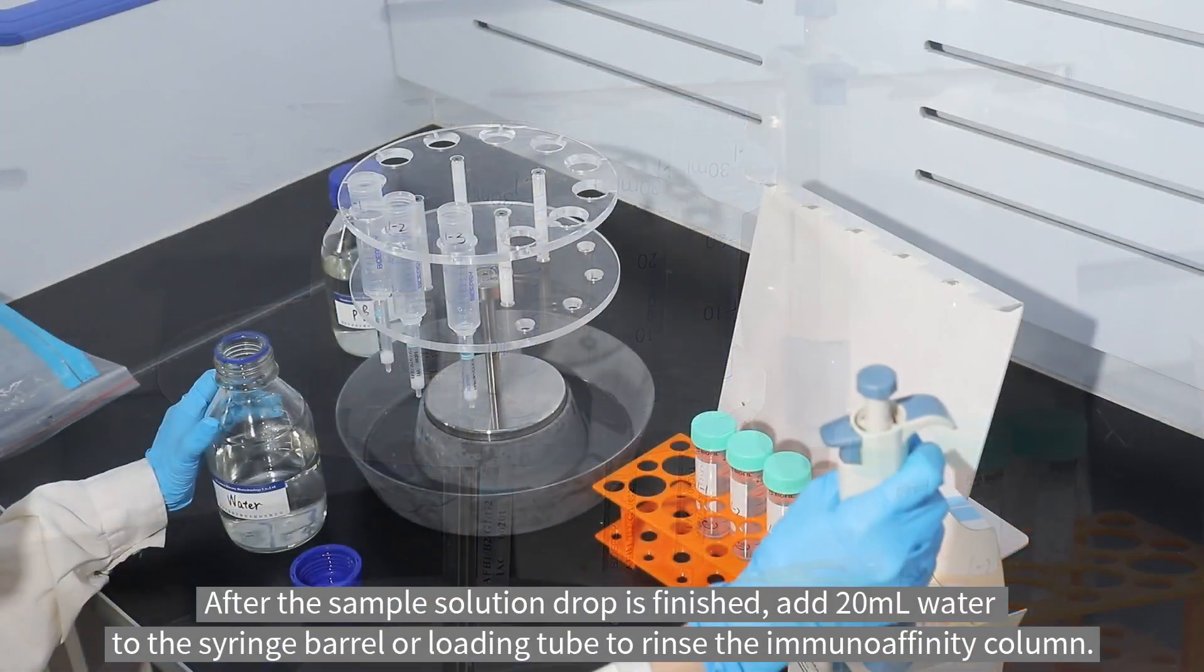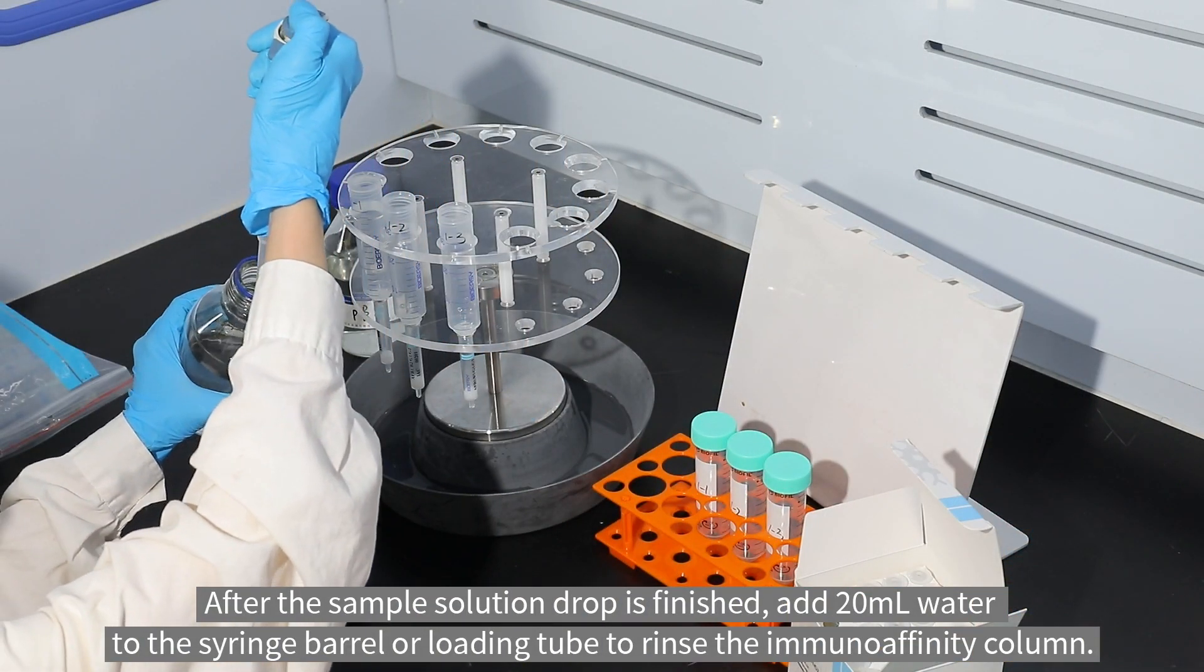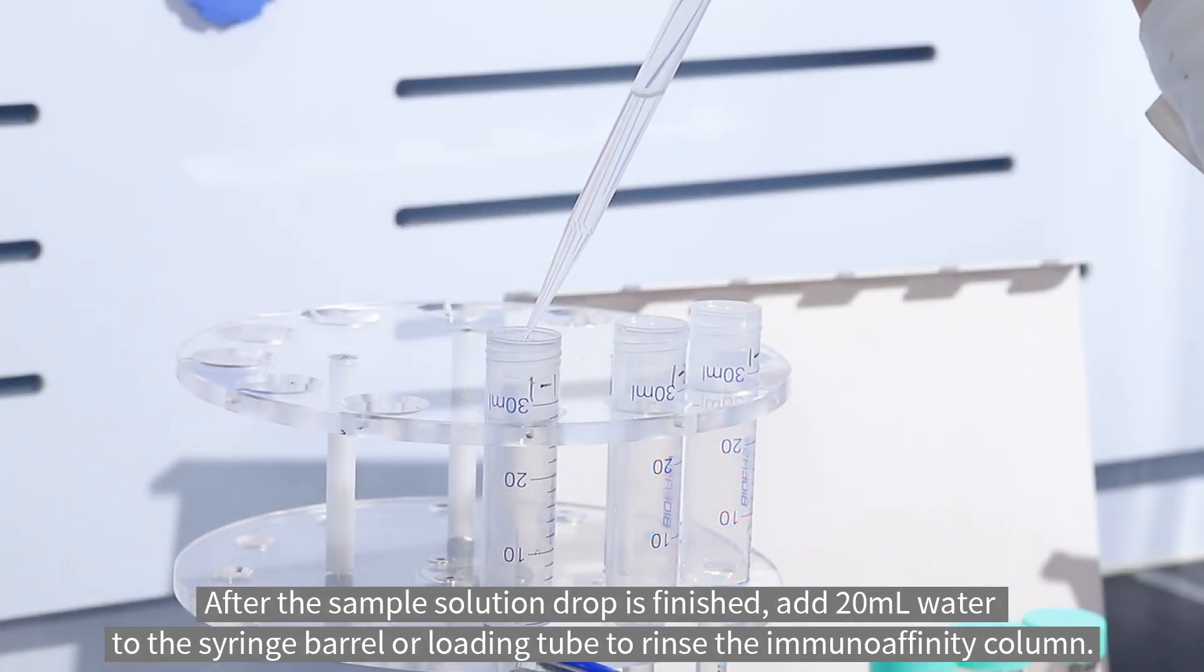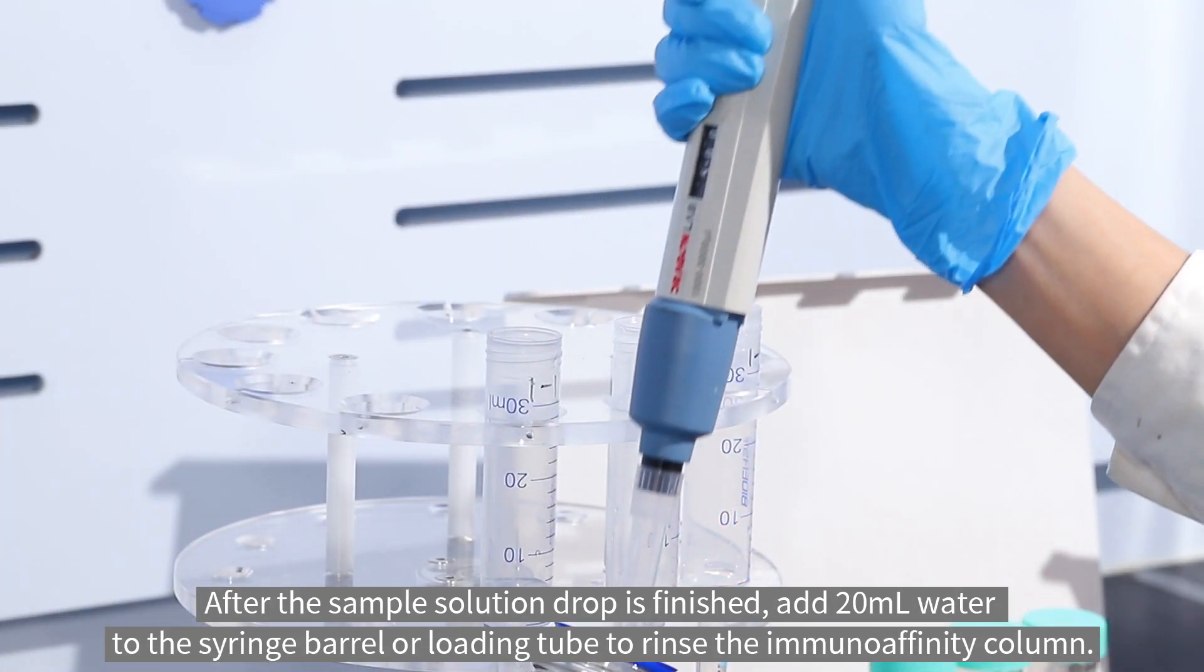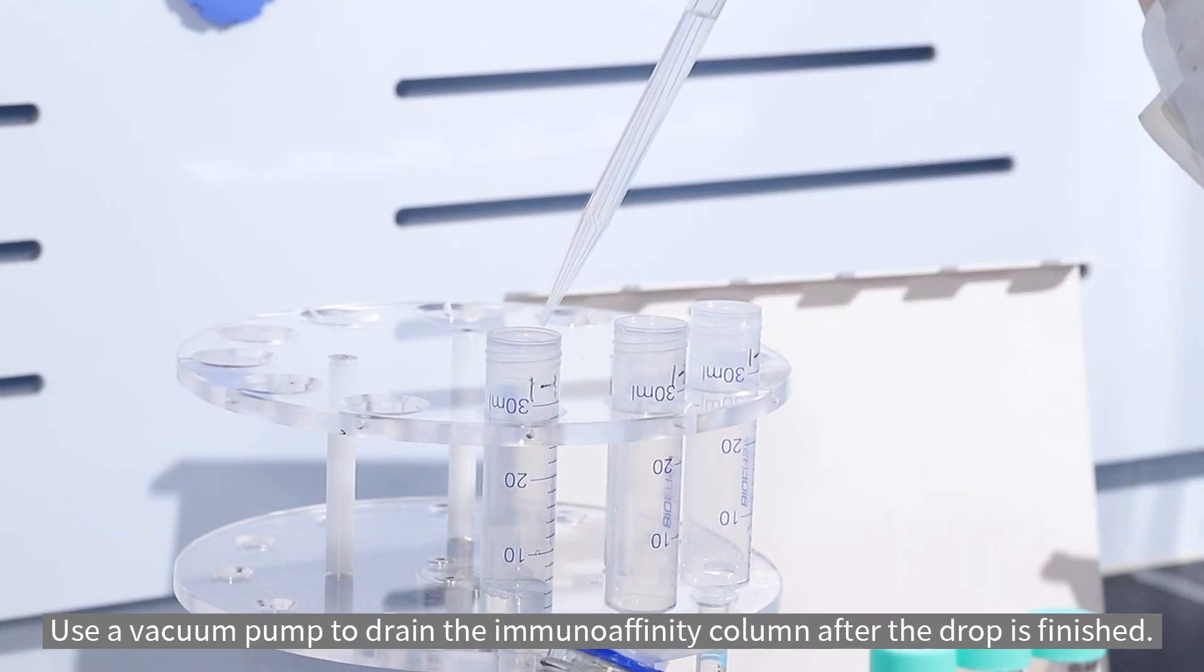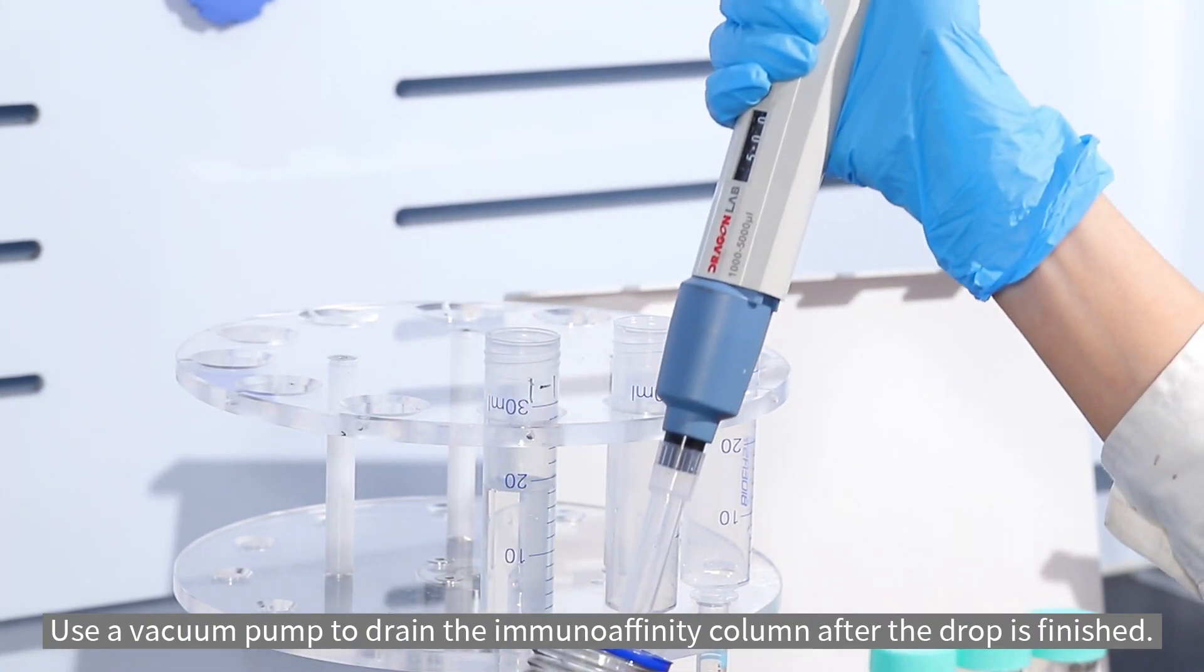After the sample solution drop is finished, add 20 milliliter water to the syringe barrel or loading tube to rinse the immunoaffinity column. Use a vacuum pump to drain the immunoaffinity column after the drop is finished.